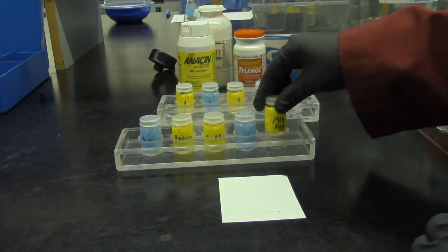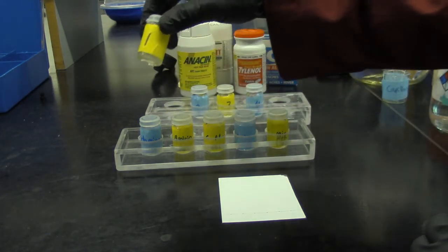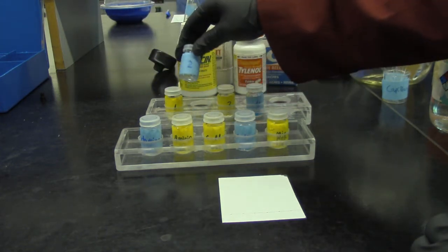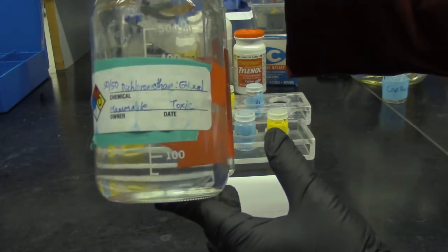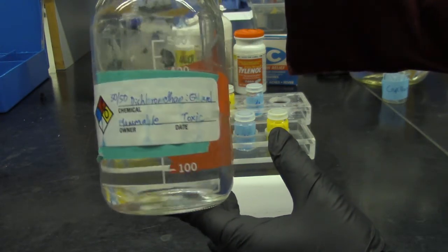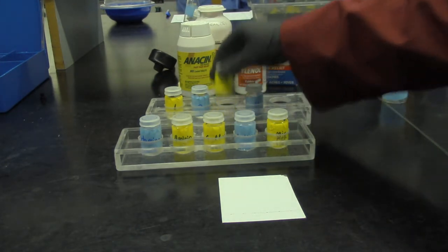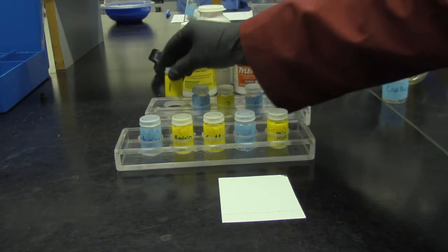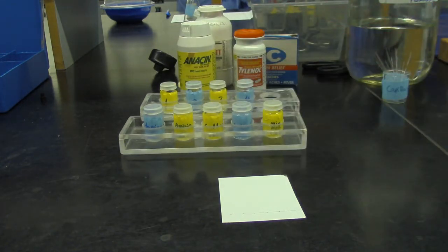For the tablets, I took about half a tablet of each unknown, crushed it, and dissolved it in 5 ml of 50-50 dichloromethane and ethanol. So these are all prepared, and all the drugs are well dissolved in the mixture. We're ready to spot the TLC plate.